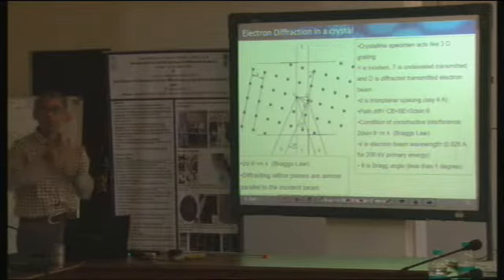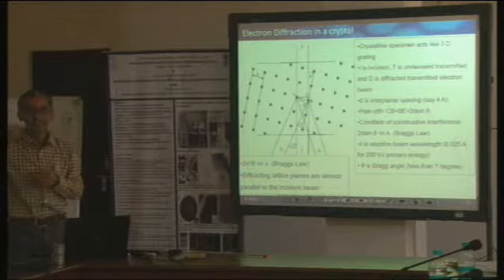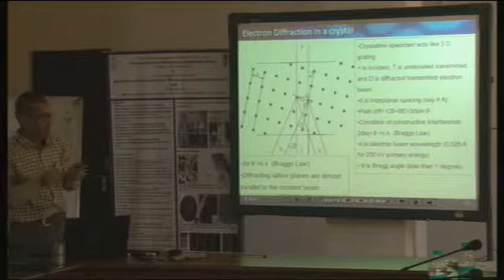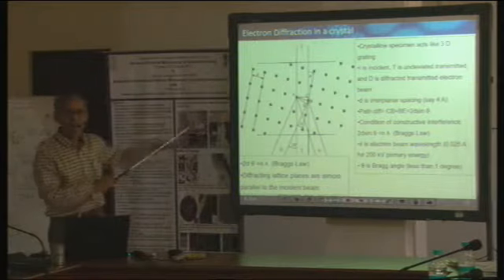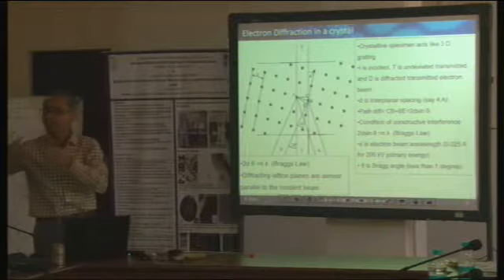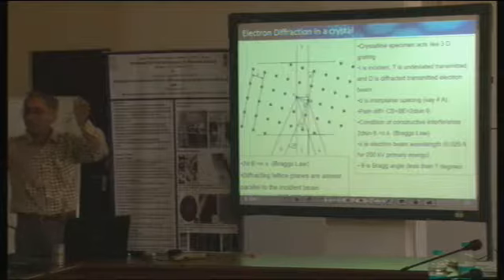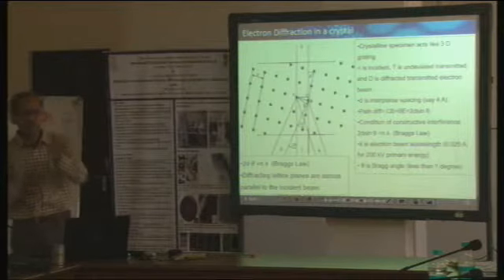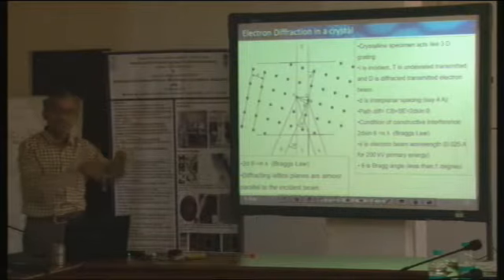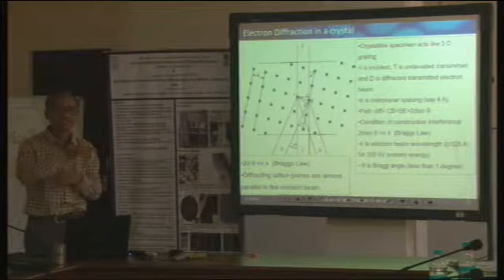You try to contrast this with what is happening in X-ray diffraction. That you do as a home exercise, and probably we will do that in the afternoon today when we solve the exercises. We have some exercise which handles this part. In normal X-ray diffraction, if you imagine any X-ray diffractogram, you vary your 2 theta angle from 4 degrees to about 90 degrees, isn't it? Whereas here, everything is happening in less than 1 degree. Correct? So the angles are extremely small.